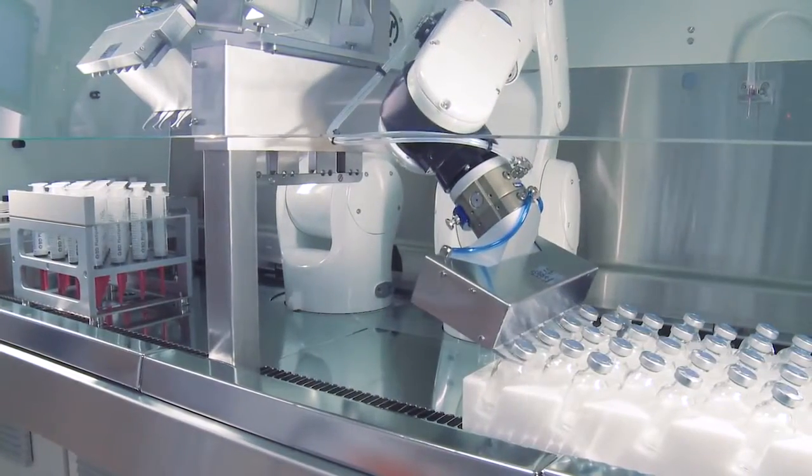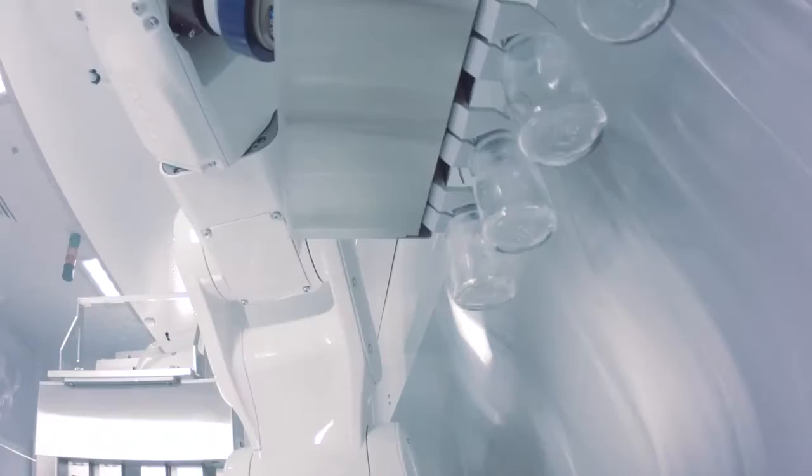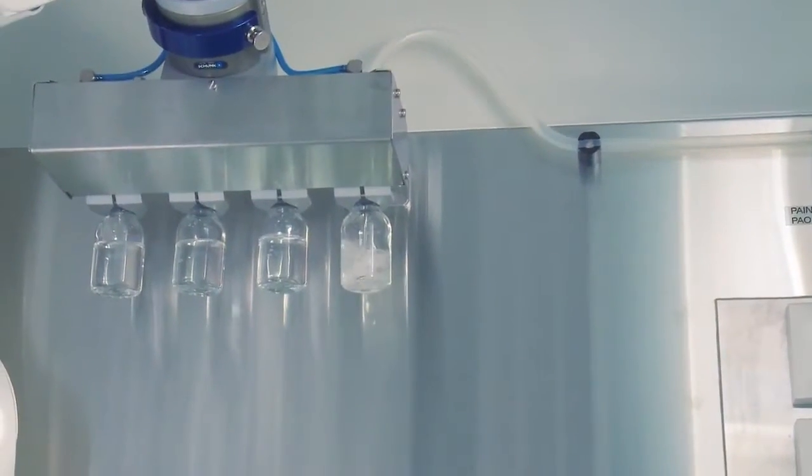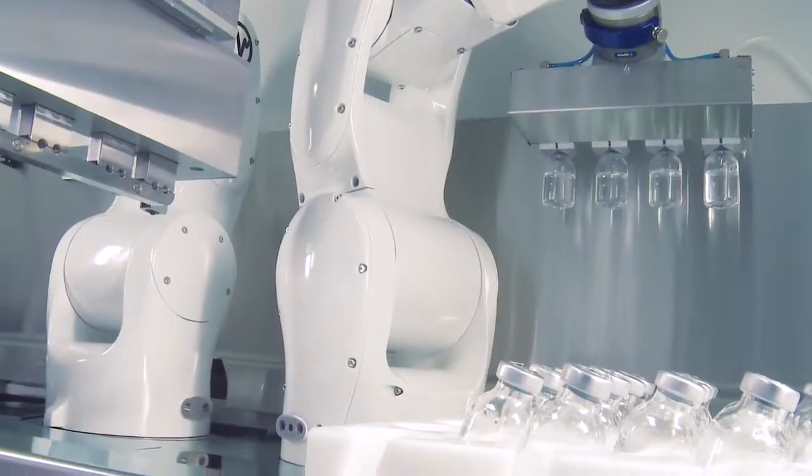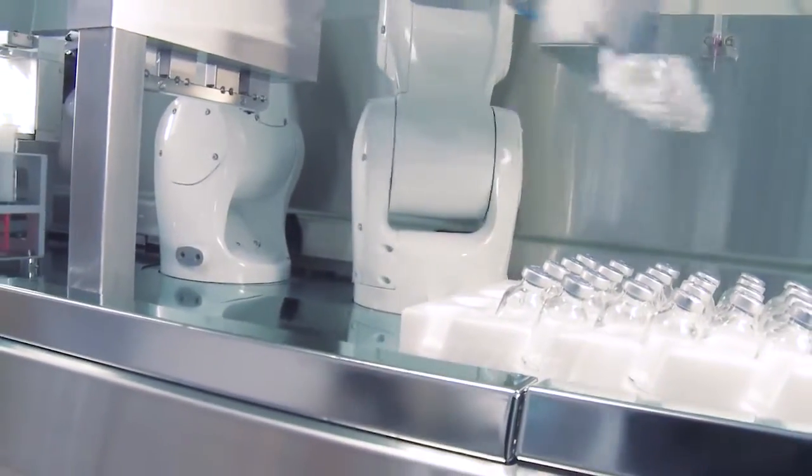One robot grabs the dose vials and individually adds solvent to each one. The dose vials are mixed to dissolve the medicinal substance.